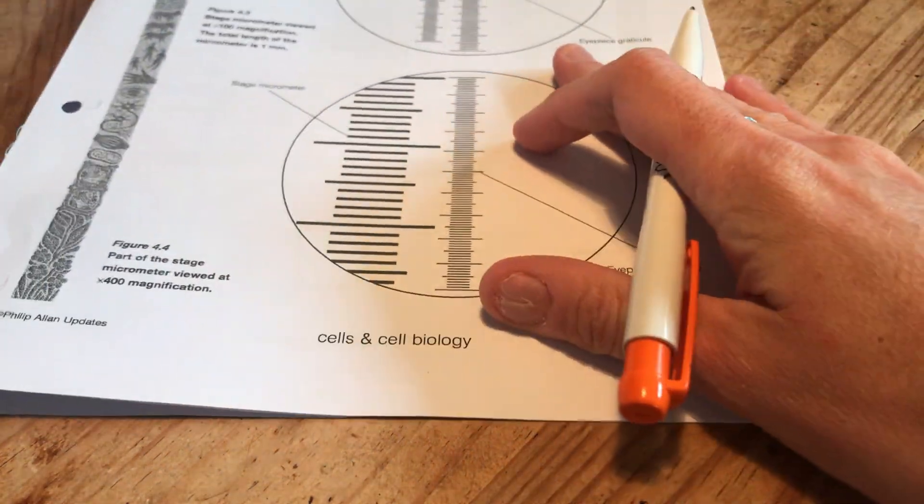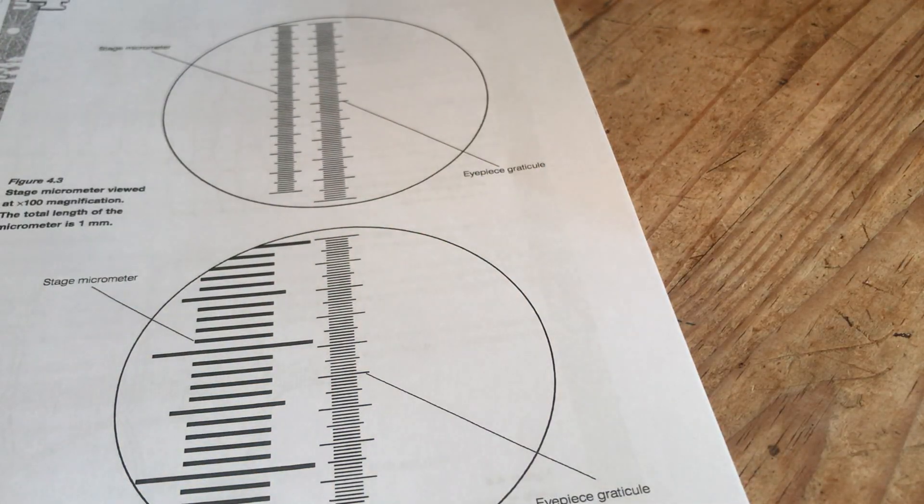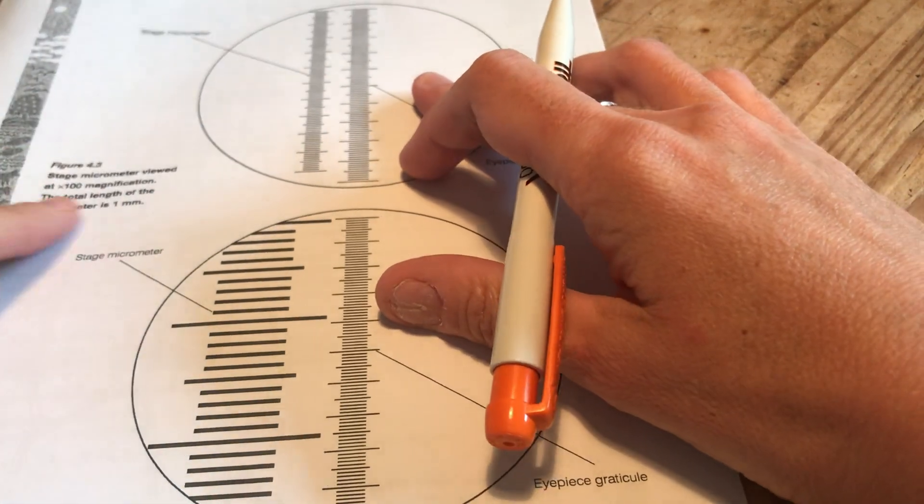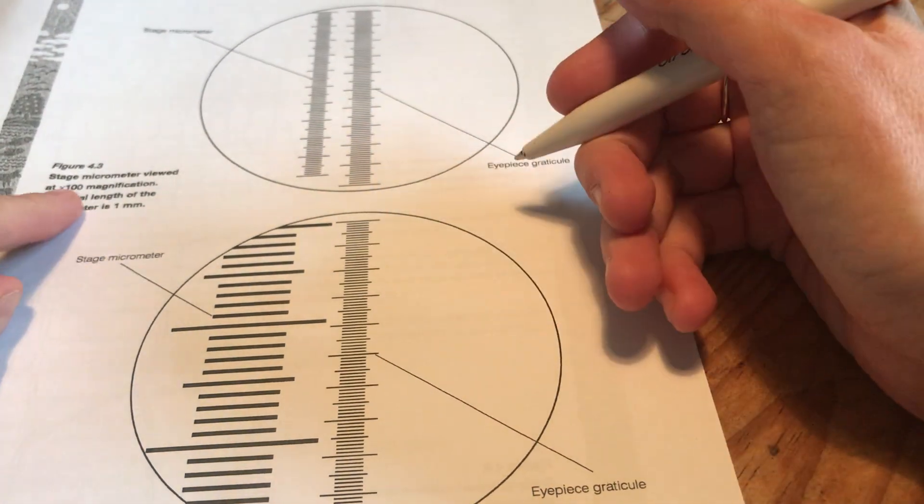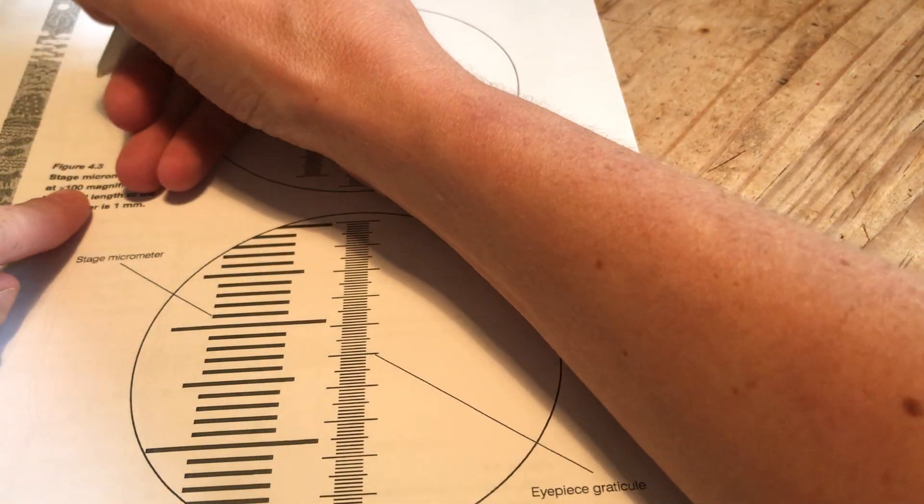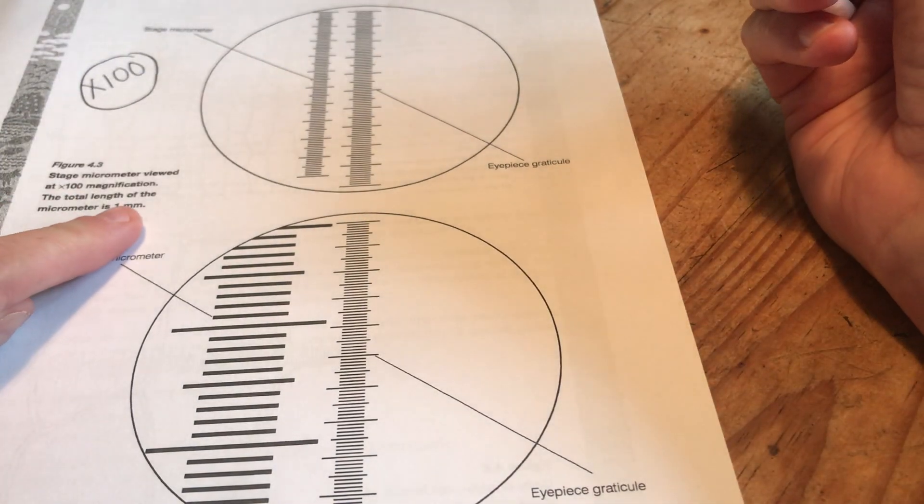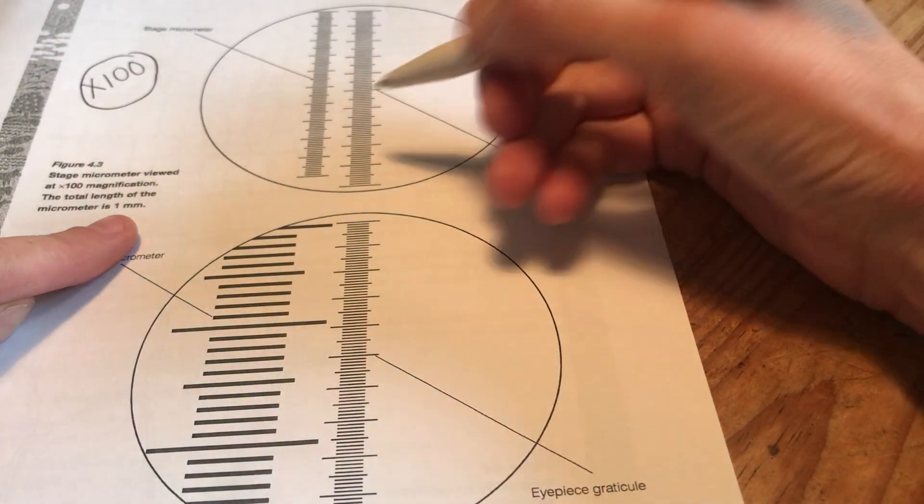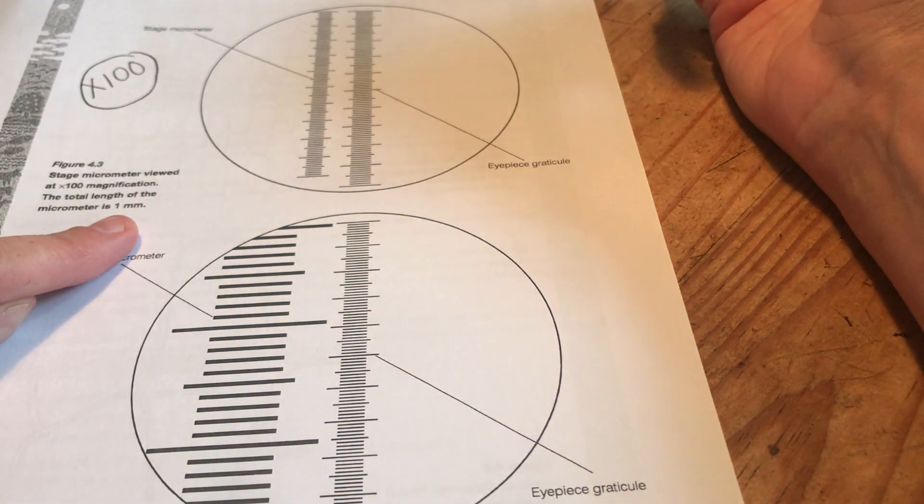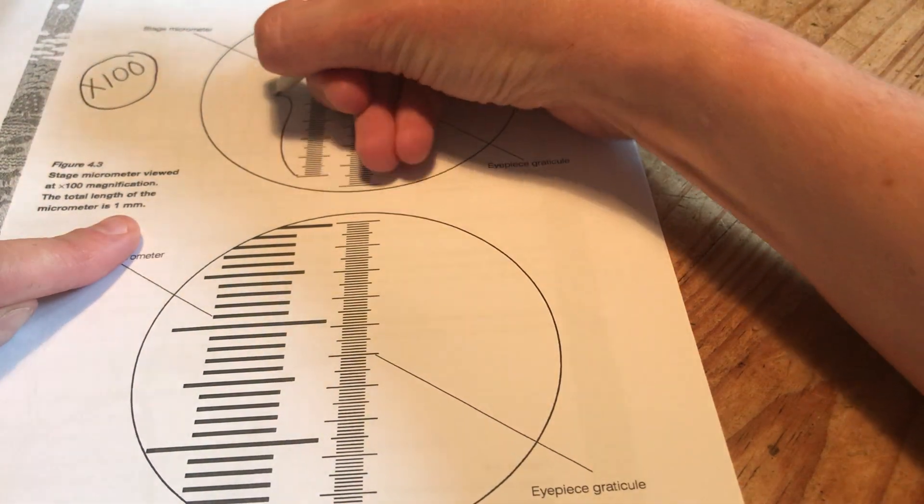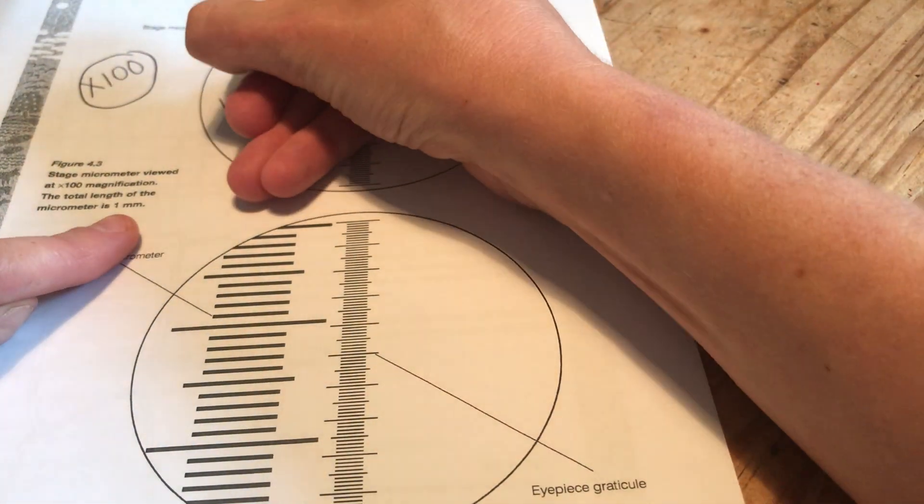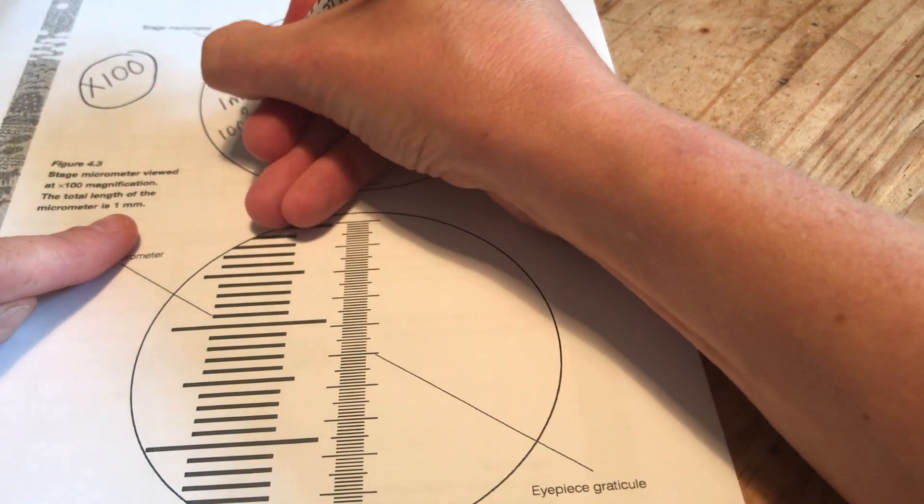Right let's find figure 4.3. So I know from figure 4.3 it tells me here it's been viewed at times 100 magnification. I'm just going to write that big there to help me remember later on and it tells me the total length of the micrometer is one millimeter or a thousand micrometers.